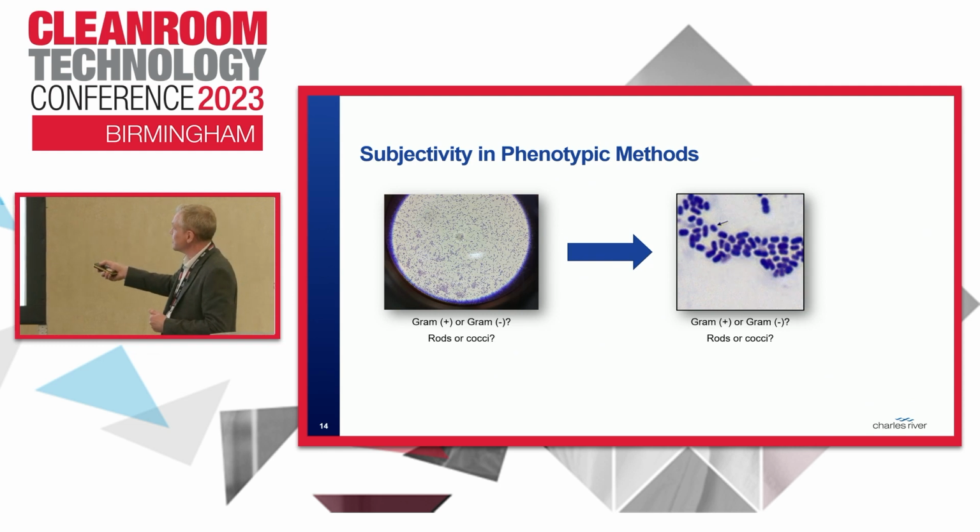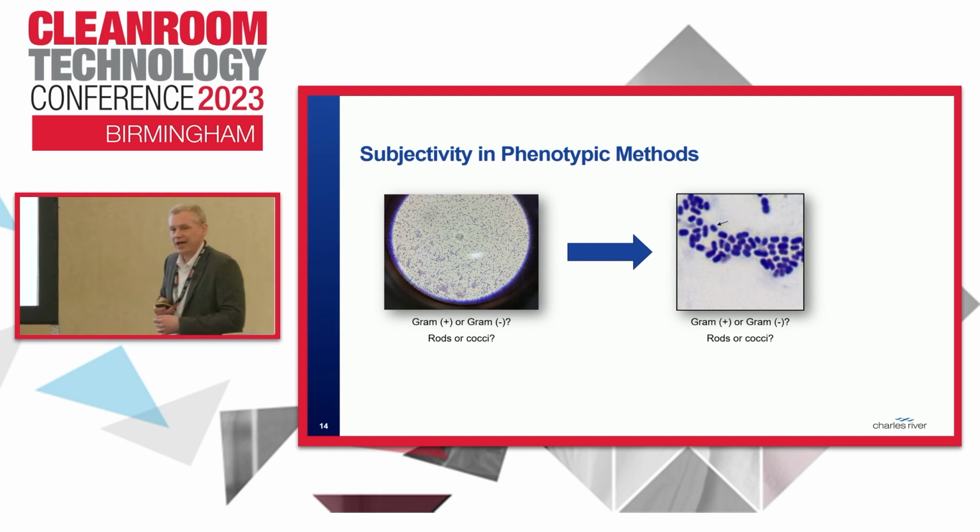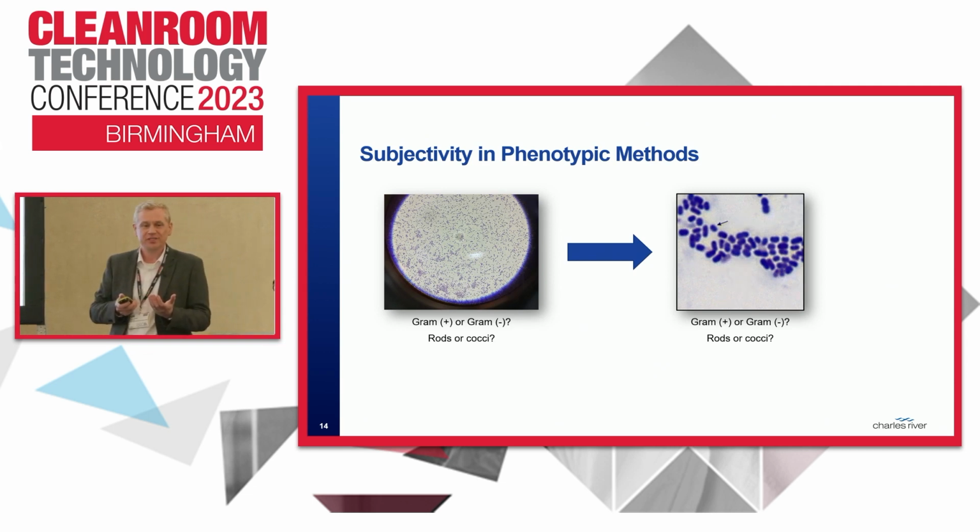This is a gram stain of an Acinetobacter. Okay? Now, you can see the one with the arrow next to it. It's a little bit more of an oval than a nice circle. Okay? And that indicates how difficult it can actually be when you're looking down a microscope to say, is that a circle or a rod? Some rods are nice and long and really obvious. Sometimes they're really short, it can look just like a cocci.